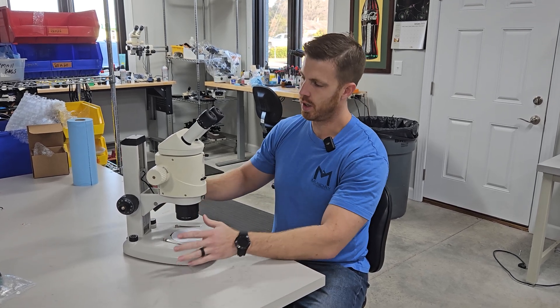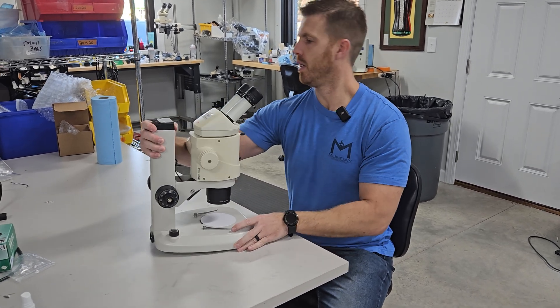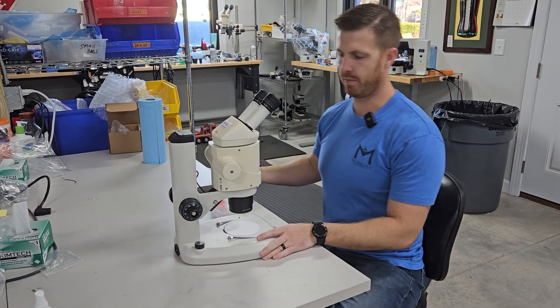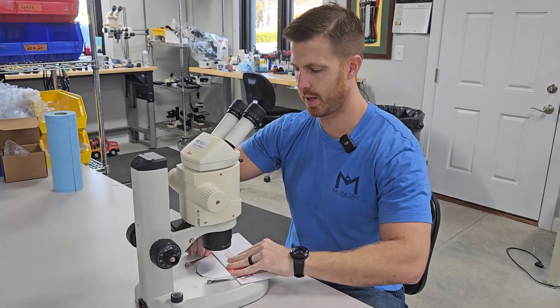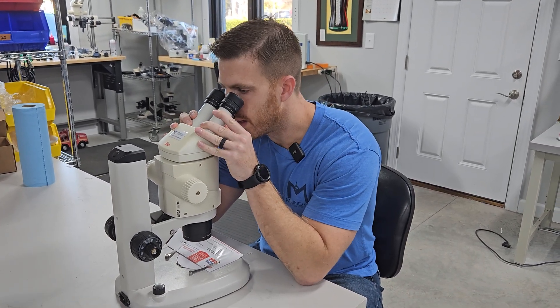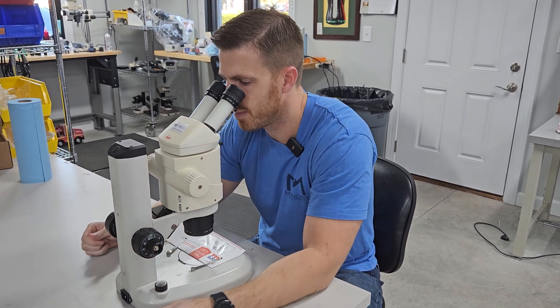First things first, you want to bring the specimen into focus. We'll just grab an envelope over here, use the base to hold it down, and then bring the specimen into focus.